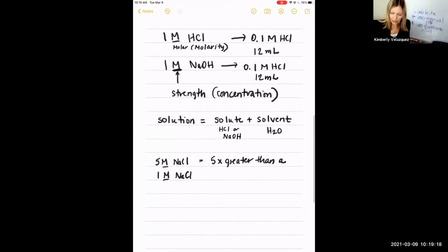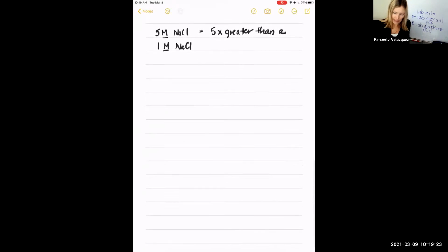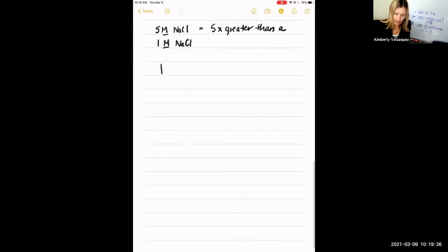So what they're telling you with that equation that they give you is they're saying that molarity initial and volume initial in ratio is equal to molarity final and volume final. I actually like thinking of it this way. I like thinking of it as molarity 1, volume 1 equals molarity 2, volume 2. You can think of it either way. Whatever makes more sense to you, go with that.